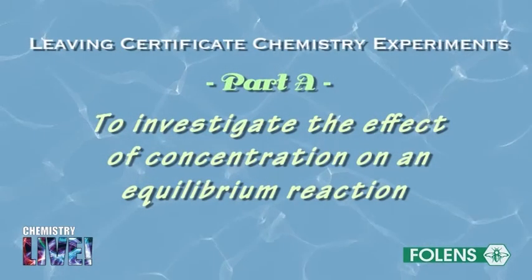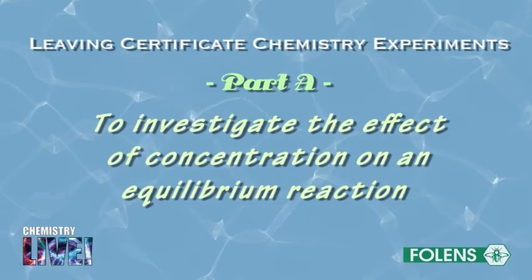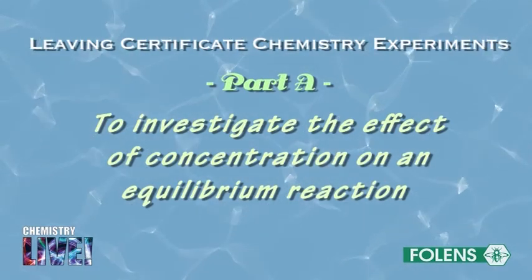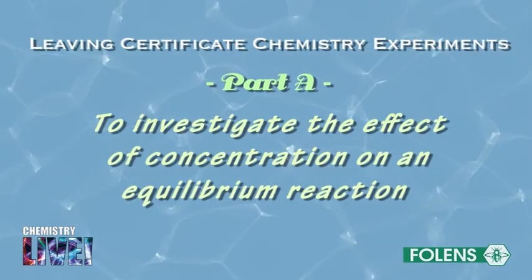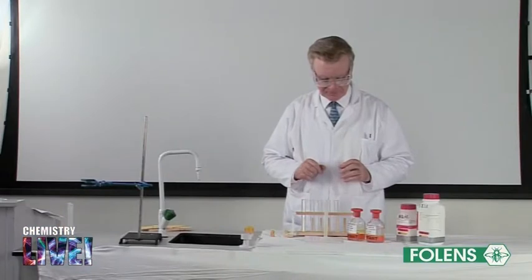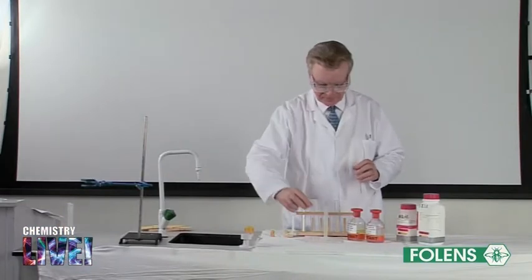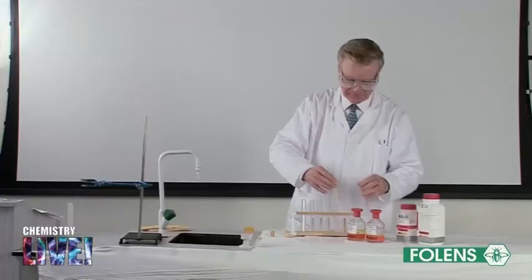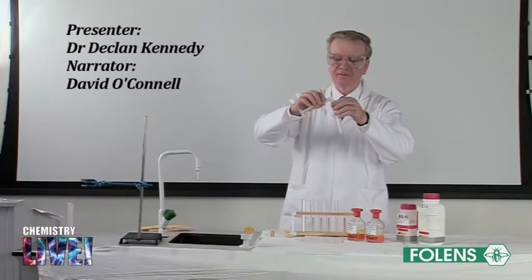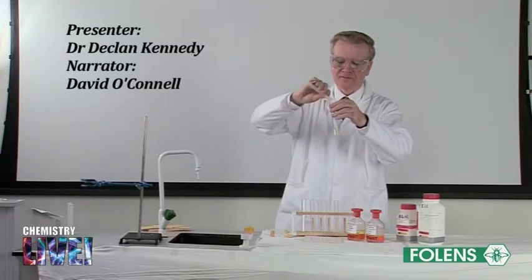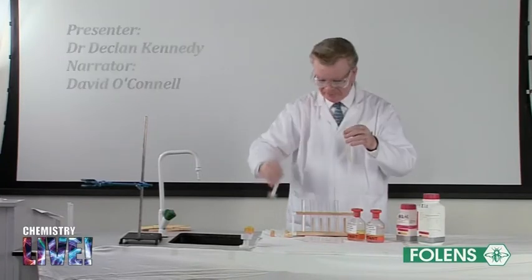In part A of this experiment we will investigate the effect of concentration on this equilibrium reaction. Mix together about 5 cm³ of a solution of iron(III) chloride and one drop of potassium thiocyanate solution in a test tube.